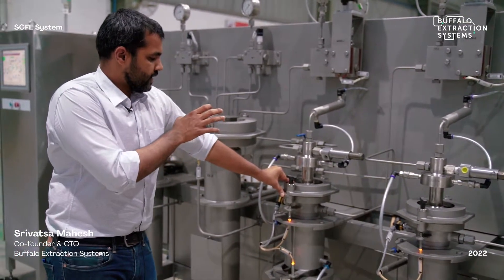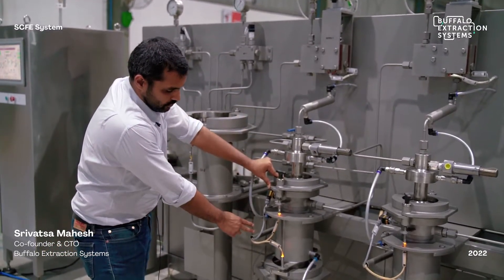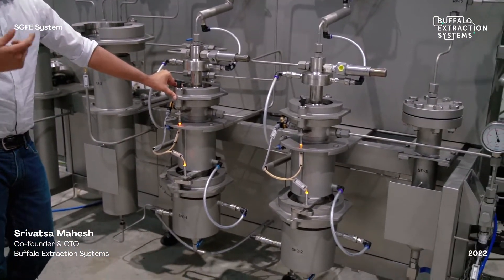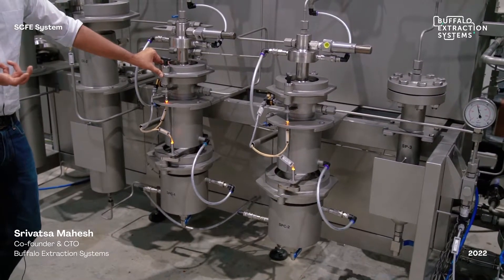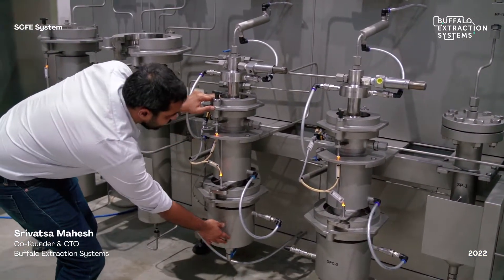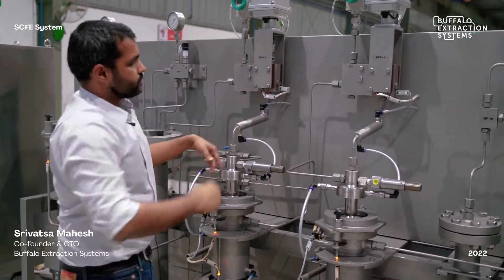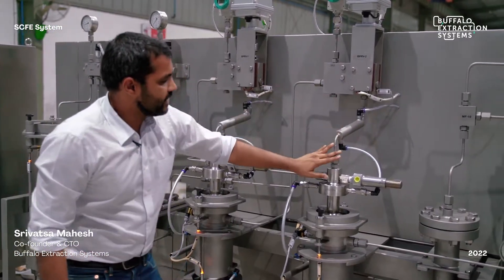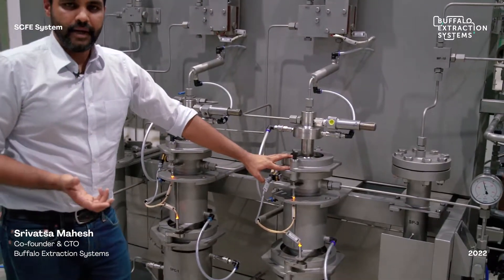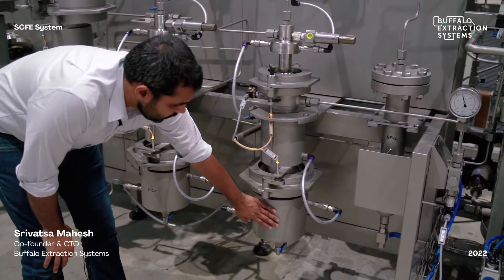During extraction, oil and CO2 pass through the first separator, where the fats, lipids, or heavier molecular weight fractions fall into the collection vessel, while the CO2 passes up into the second back pressure regulator. After passing through the second back pressure regulator, the CO2 becomes a complete gas at 60 bar, and all remaining oils are collected into the collection vessels.